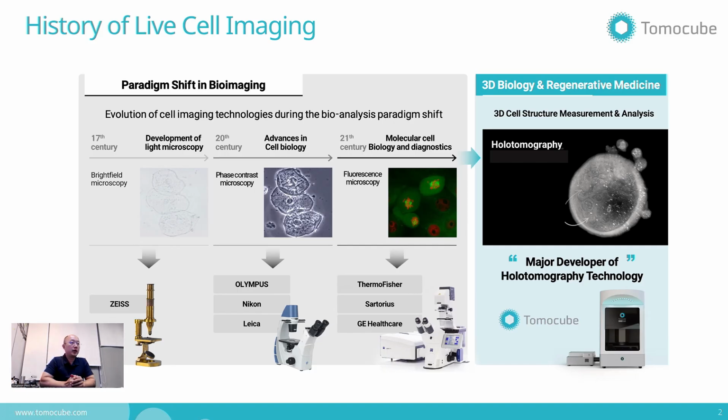And modern biology is driven by molecular specificity. So by using exogenous labeling agents such as molecular probes or molecular staining agents such as fluorescent proteins, you can see individual proteins and fluorescent-labeled objects inside of cells, which has opened doors to molecular biology and molecular diagnosis in application.